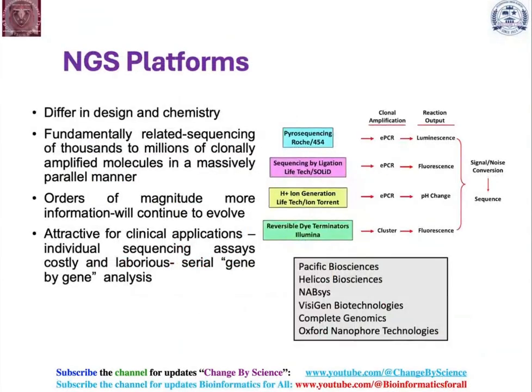So NGS platforms are diverse platforms, differing in design and chemistry, fundamentally related to sequencing of thousands to millions of clonally amplified molecules in a massively parallel manner. Orders of magnitude more information will continue to evolve and has already evolved.